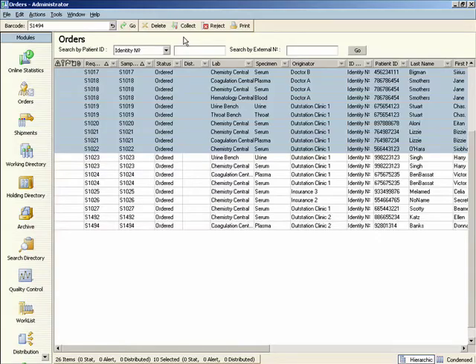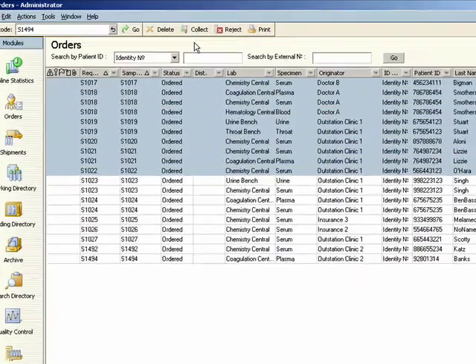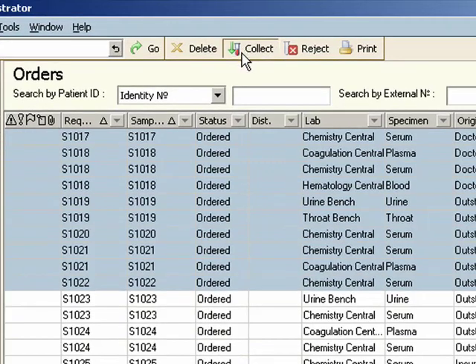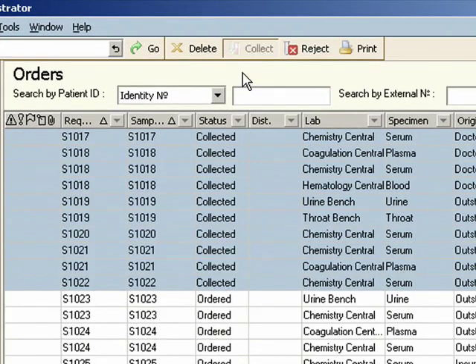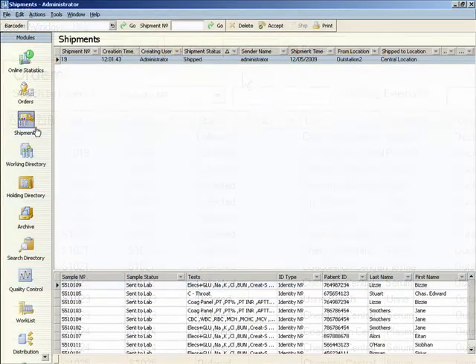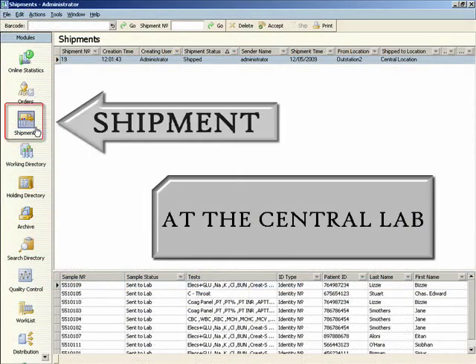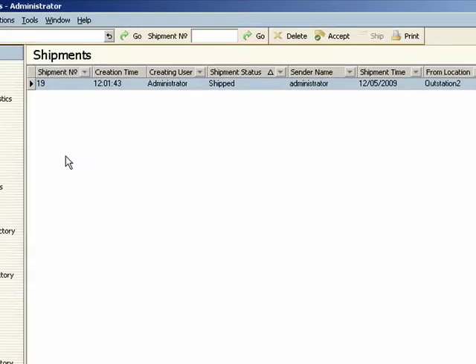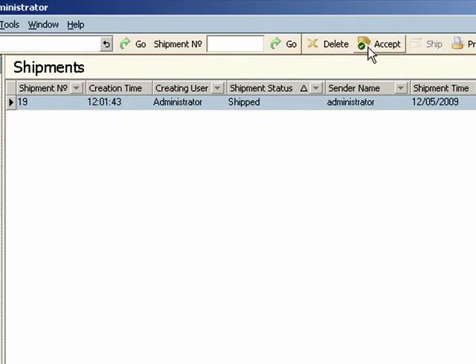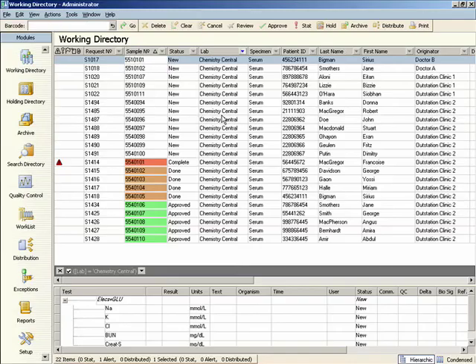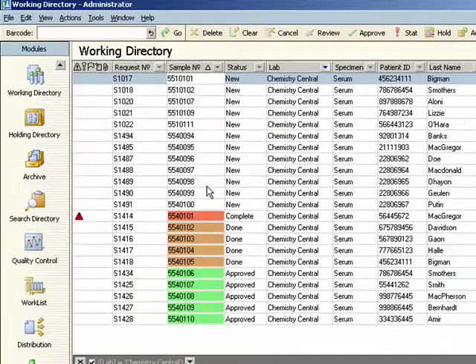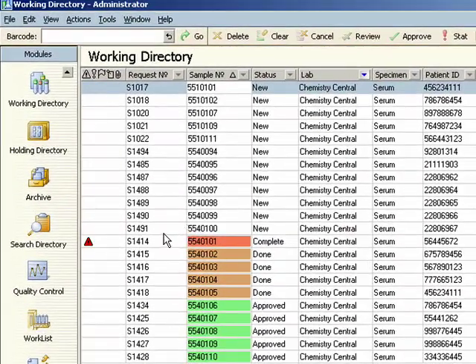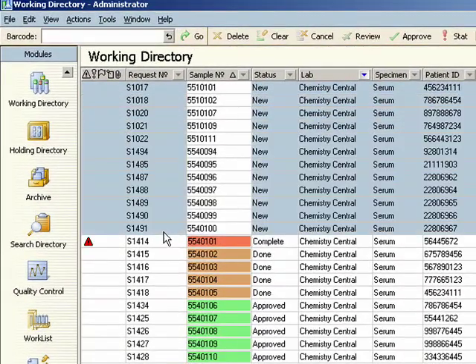The samples are then collected and combined into shipments. On shipment reception, samples are registered. eLab automatically assigns every sample and test to the correct laboratory.